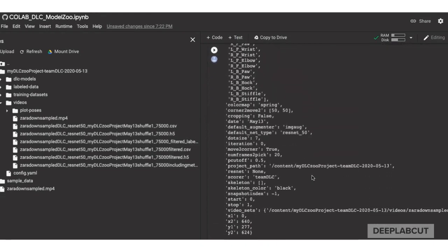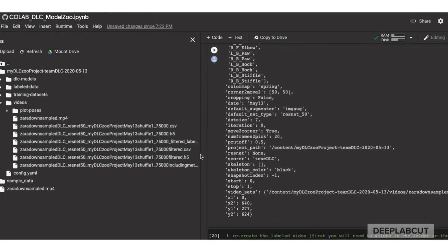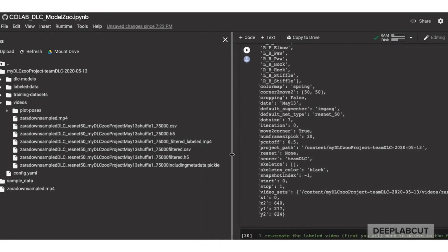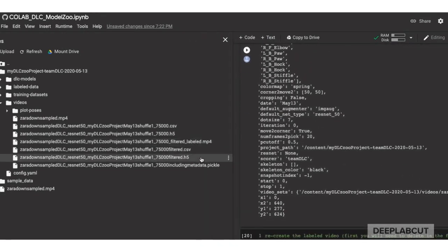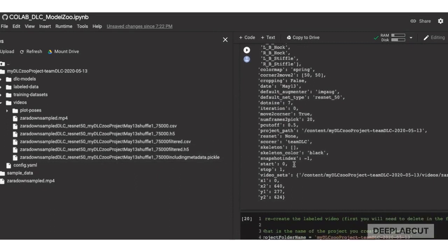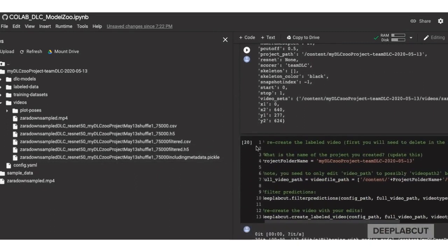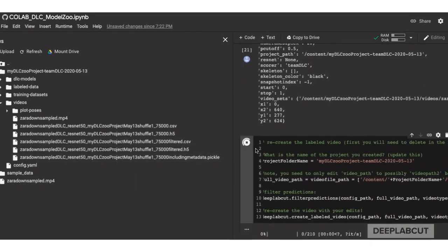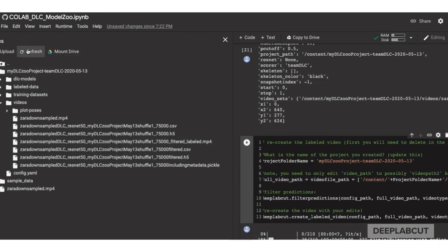Now just to show you one more time, you can of course delete this created video, reset anything that you like, namely maybe the dot size, as it was a little too small, so I'll put it into squares, or the color map, let's pick something a little more festive, spring.